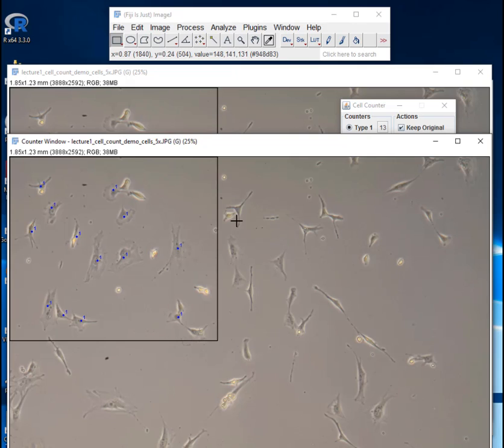While we're here, I have one last thing to show you. In all pictures for scientific publication, you need to show some sort of scale so your readers know how big things are. So we need to put a scale bar in our image.